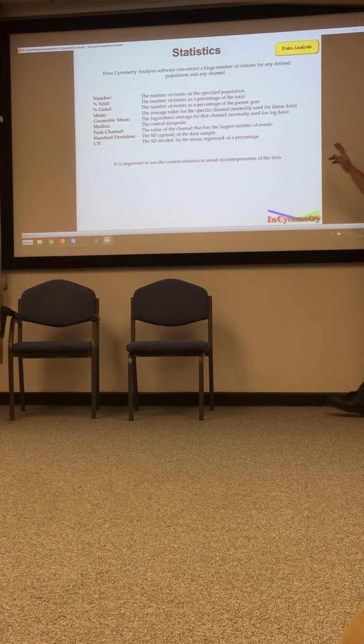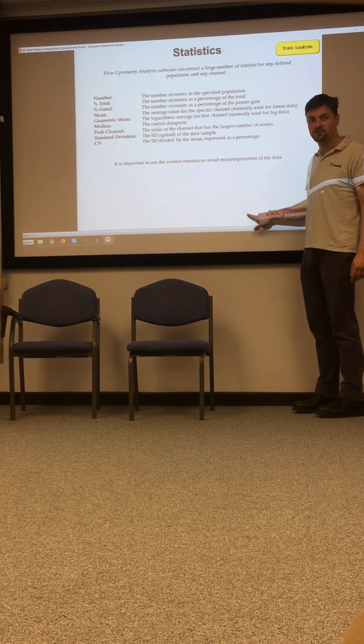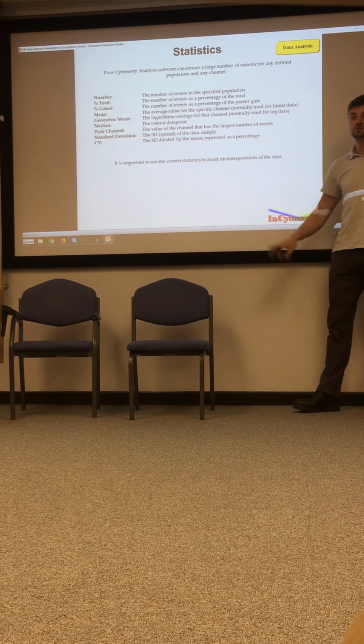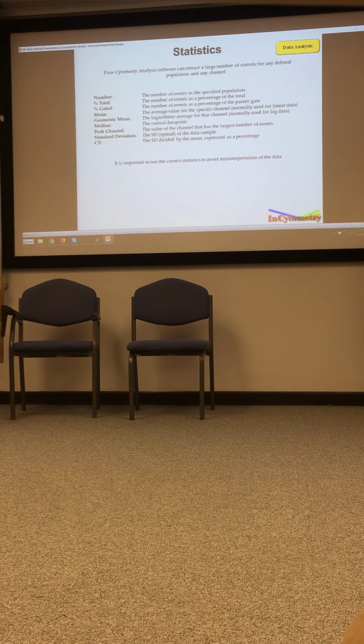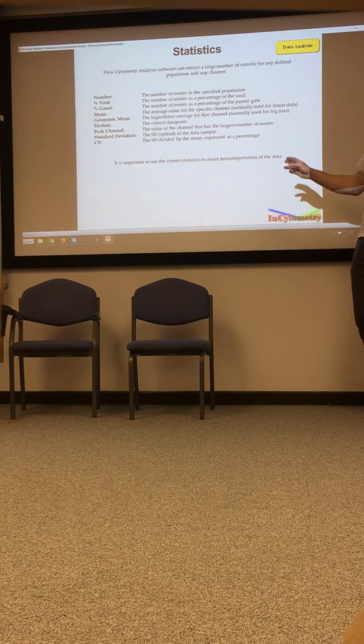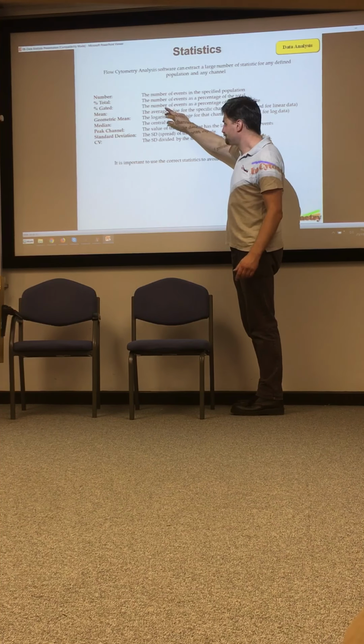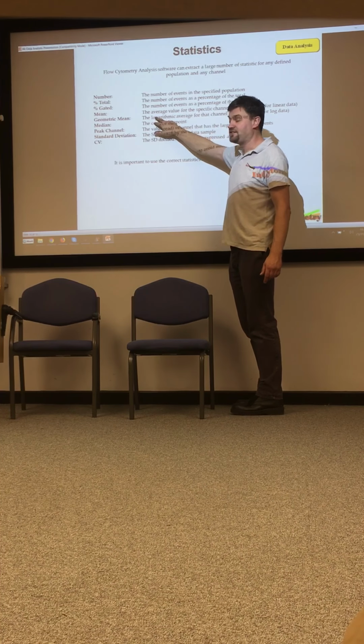The downside to that is that if you have a population that looks like that with a side population on it, the median won't really change whether the side population's there or not. Because it's not really affected by outliers, and the side population's outliers. But the geometric mean will. So can you use any of those though if you've got a bimodal population? You can use either, yes, you can use either of these.